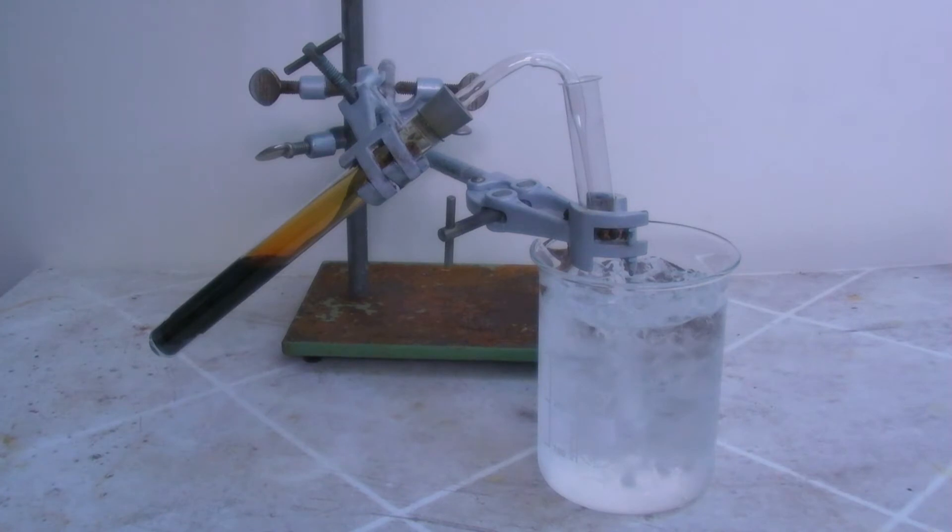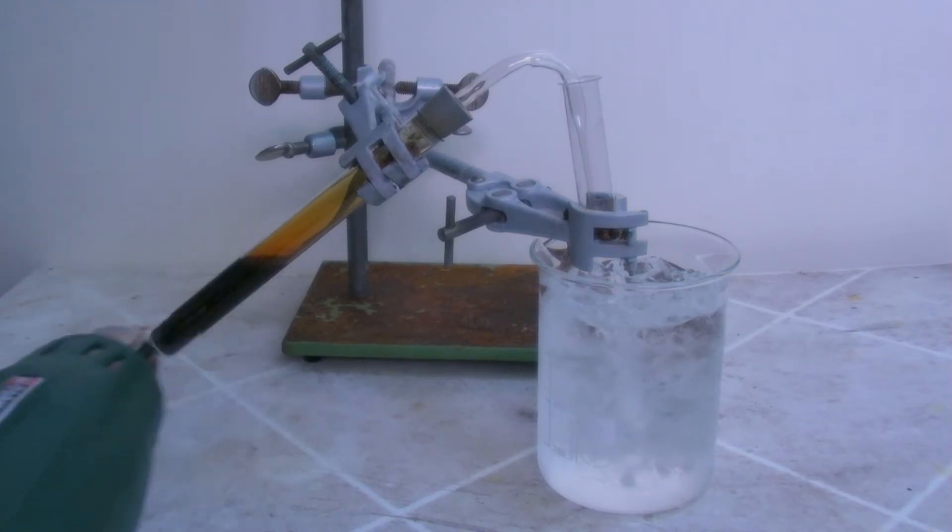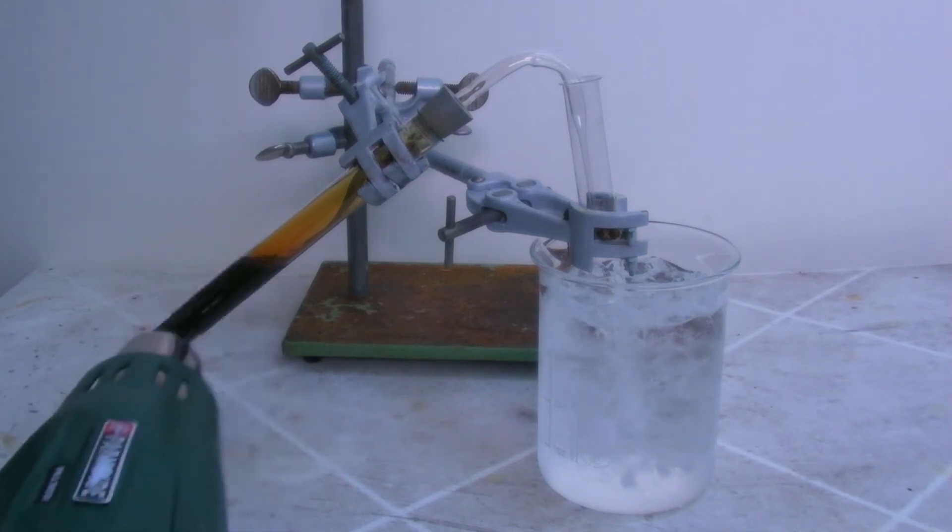In the end, the mixture is heated carefully and widespread with a heat gun to speed up the reaction. It has to be taken care that it doesn't boil too vigorously.